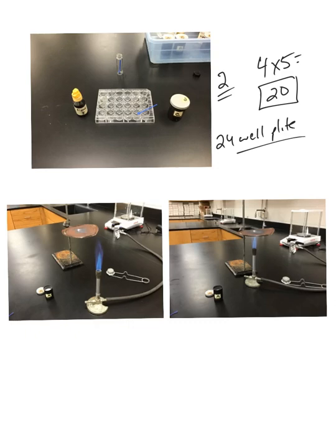So in the first well, you might do the combination of powder A plus liquid 1. Okay, and then the next well down, you would do A with 2, and so on and so forth. So I would make one column be all of the same powders.